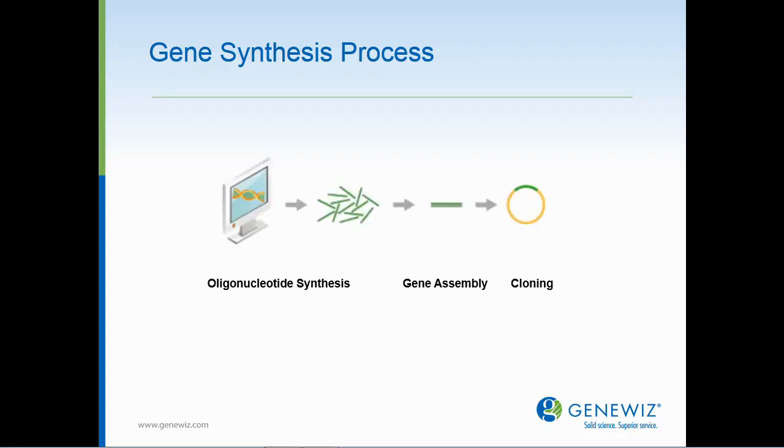Gene synthesis effectively creates changes within any specific region of a protein and also allows for the studying of the effect of one change or a combination of changes with regards to a specific protein region of interest. Here, the key word is regulated, or better yet, controlled. As one can see, this sets up a nicely streamlined system to rapidly test new and existing hypotheses related to protein structure and function.